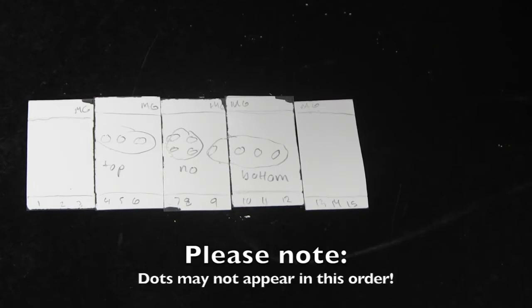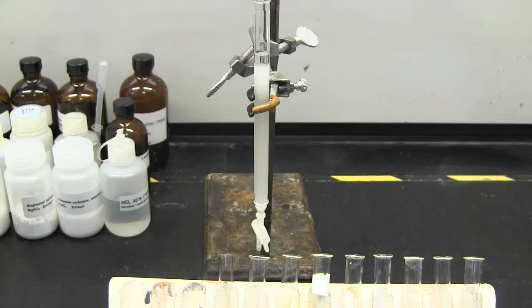Then combine like fractions. If both spots show up on a fraction, set it aside and do not combine it with anything. This would contaminate the pure sample that you pulled out of the column.